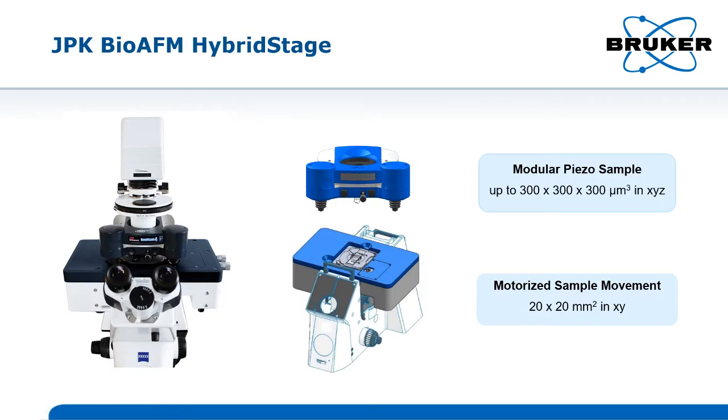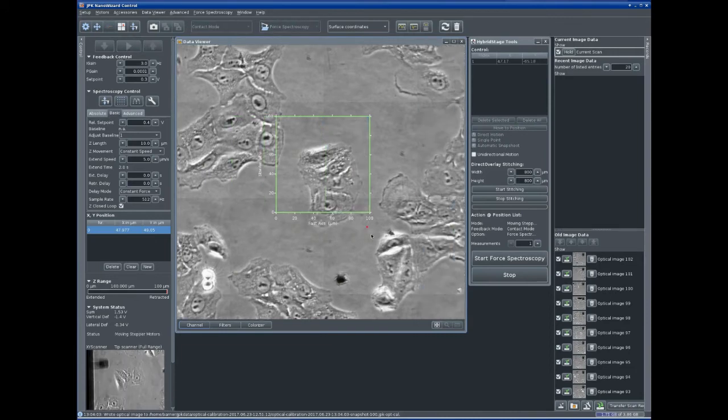The hybrid stage has been specially developed to map large objects such as cells, scaffolds, biomaterials, tissues and implants.